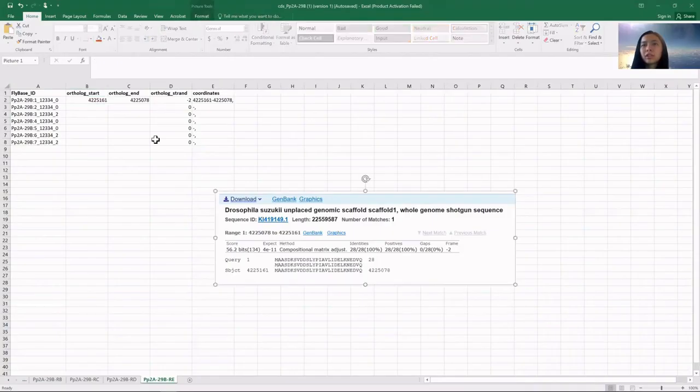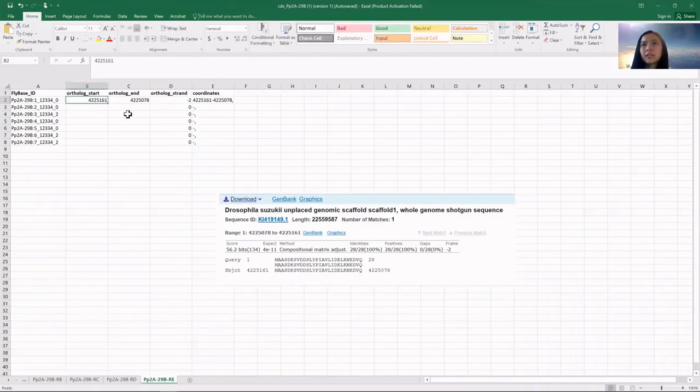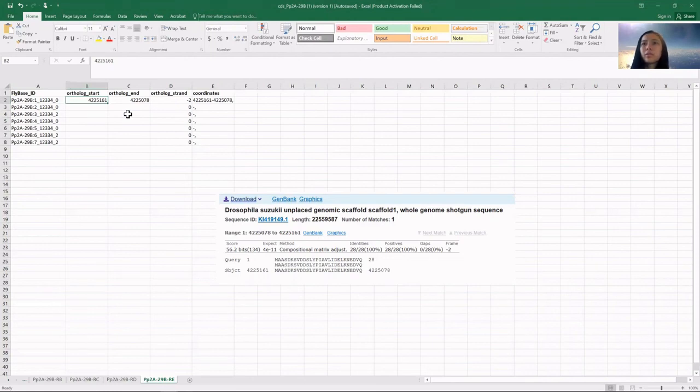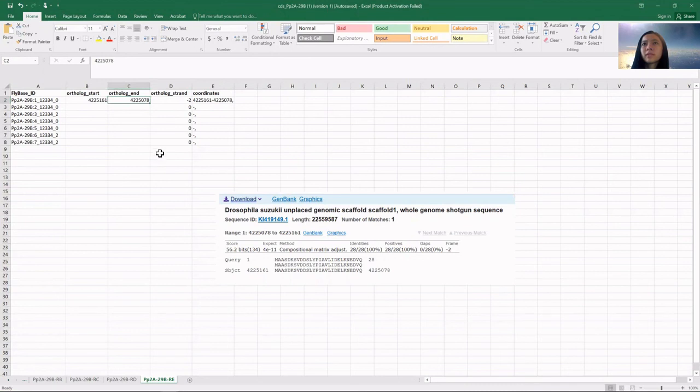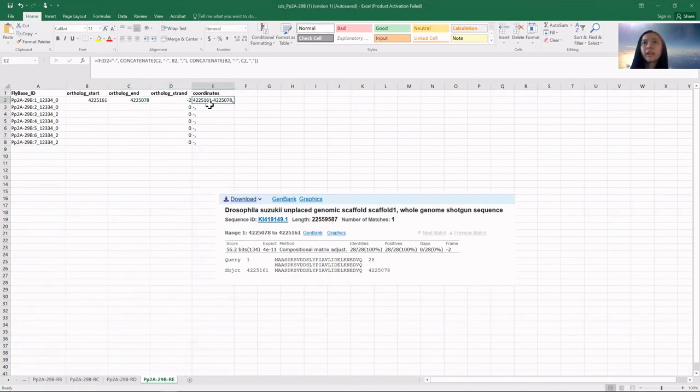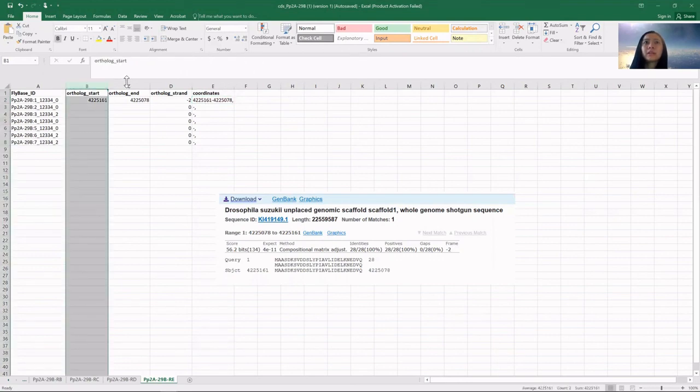I took a screenshot, and this is how I enter the predicted coordinates in this template. You have the start and end, the ortholog strand, and these coordinates will reflect automatically from columns B and C.